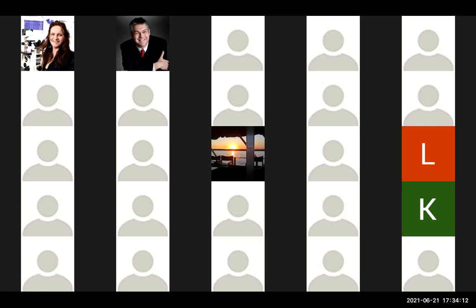There are two ways of doing that. One can either use magnetic bead sorting, which is available, or one can use a flow cytometric sorter to sort the cells so that you purify or enrich them. And the number of 70% was chosen not by myself, but by ERIC, the standards company.